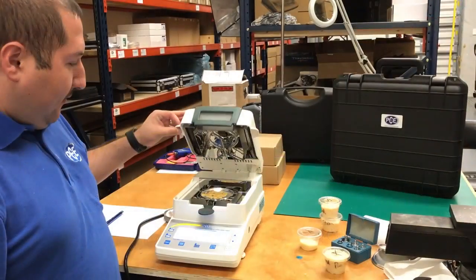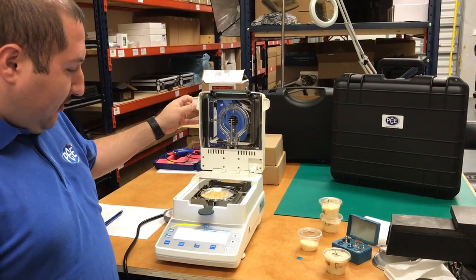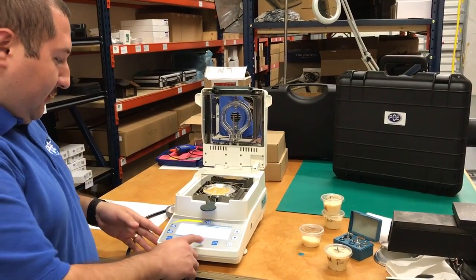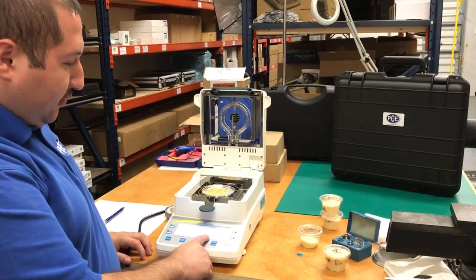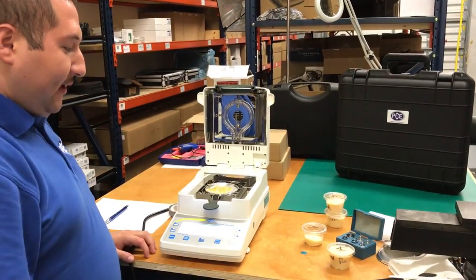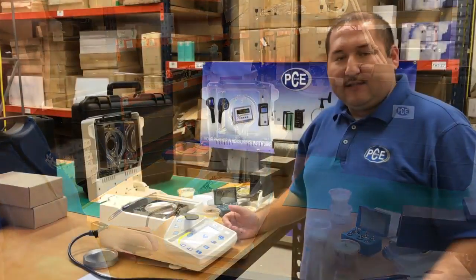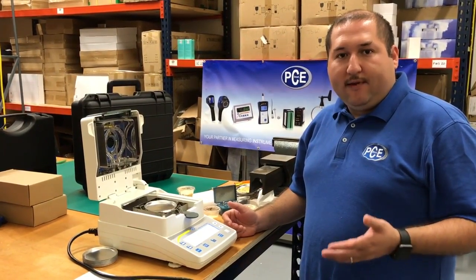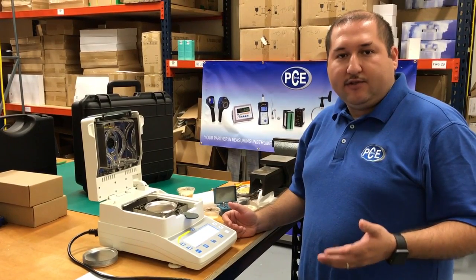Now we have finished cooking the sample, and as you can see, the moisture on the cheese was 31.9%, and it took seven minutes and 29 seconds to cook. This concludes our test, and if you have any other questions, please feel free to call us at PCE Instruments.